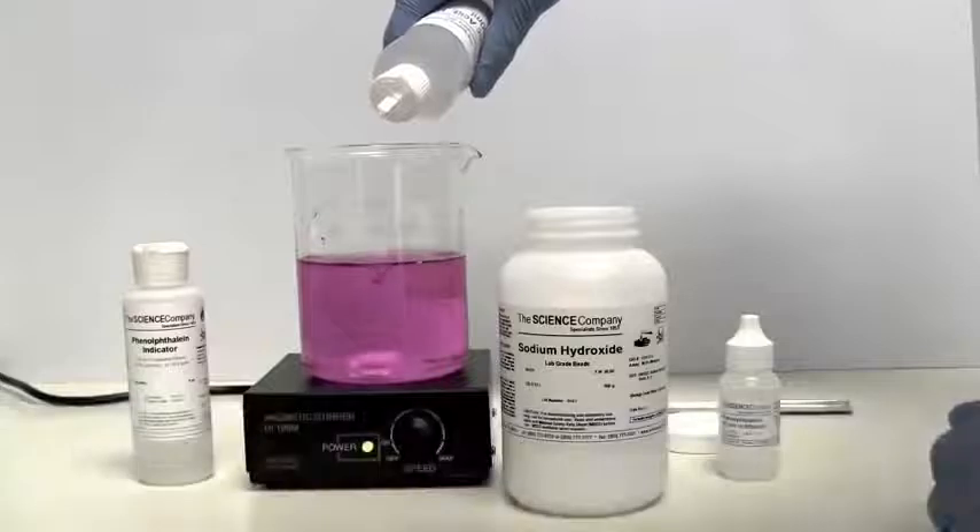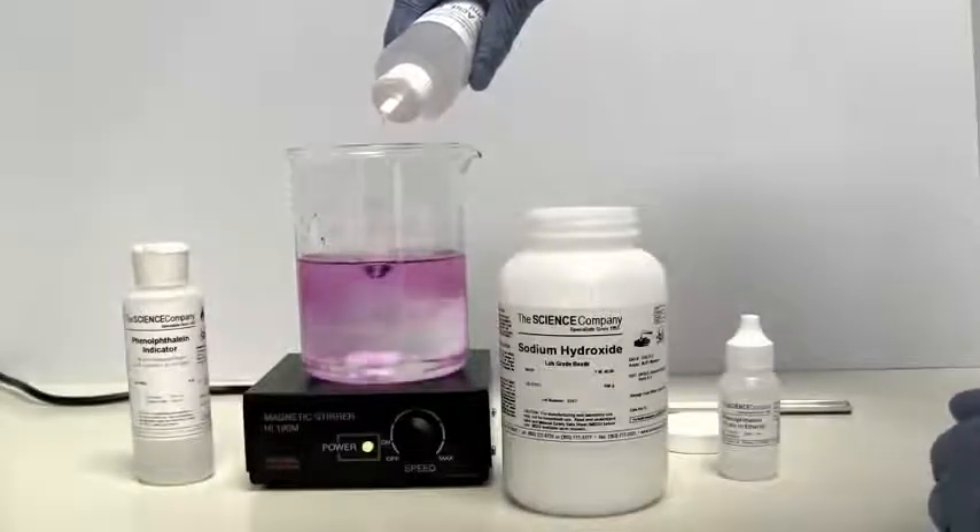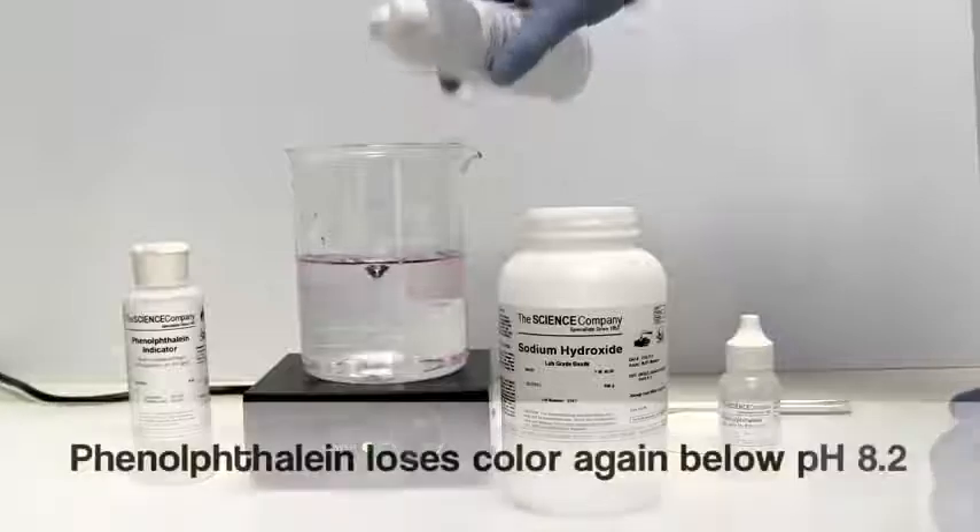As we add acid to our solution, we drive the pH below 8.2. Watch as the solution becomes clear again.